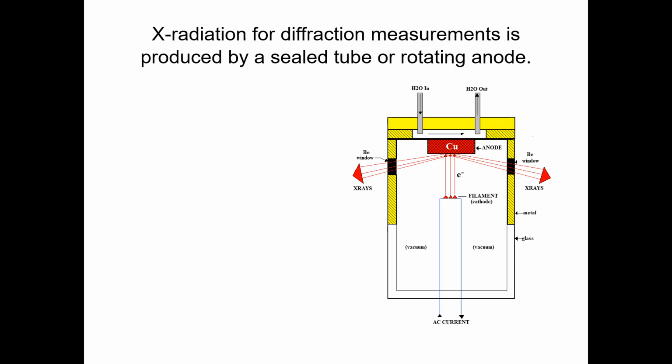So here you can see the different parts of the X-ray setup, the diffractometer. All these parts are clearly marked in this sketch. So we have a sealed X-ray tube. They tend to operate at a power in the range of 1.8 to 3 kilowatts. So that's the typical power needed to run this apparatus.